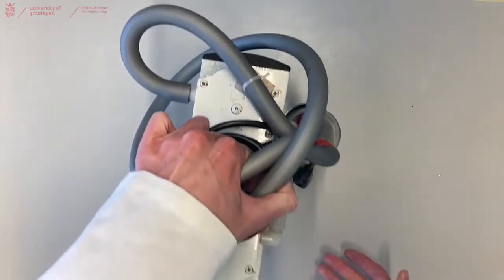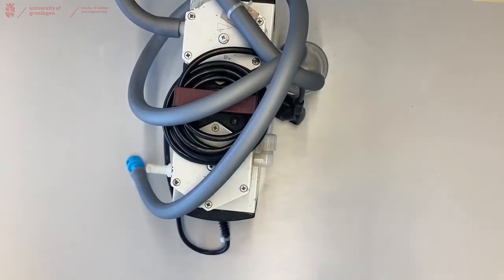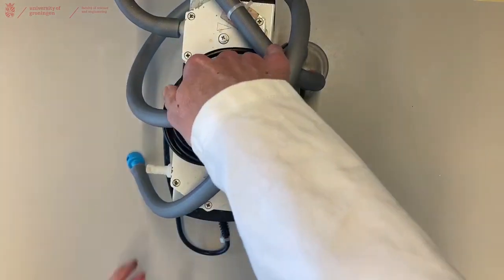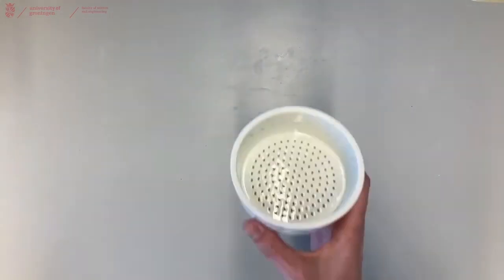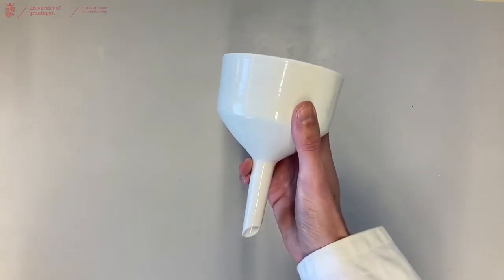For vacuum filtration you will need a vacuum, and you can do this by either using a vacuum pump or using the vacuum pump that's in line in your fume hood. Besides that, you will need your filter - in this case a Buchner funnel.